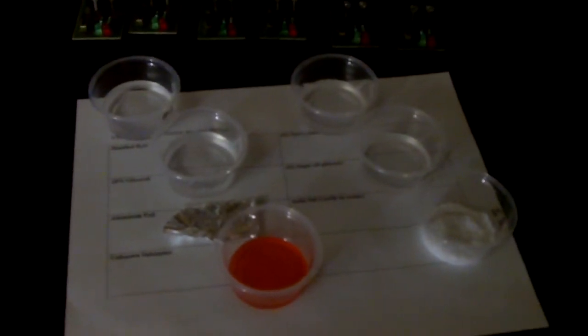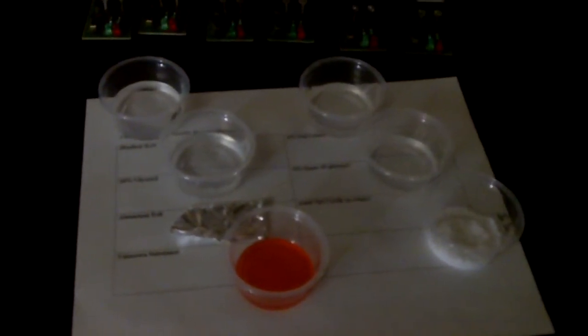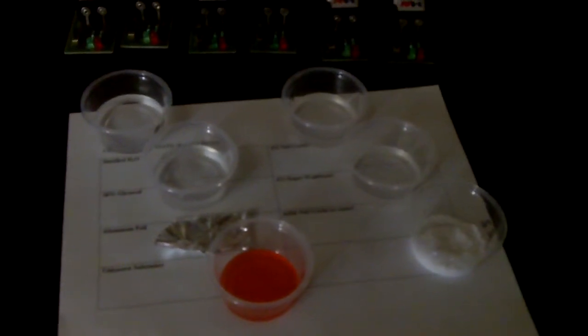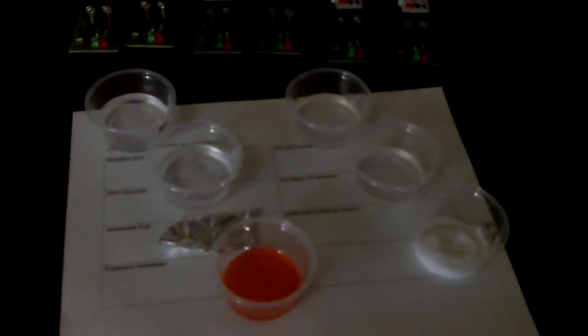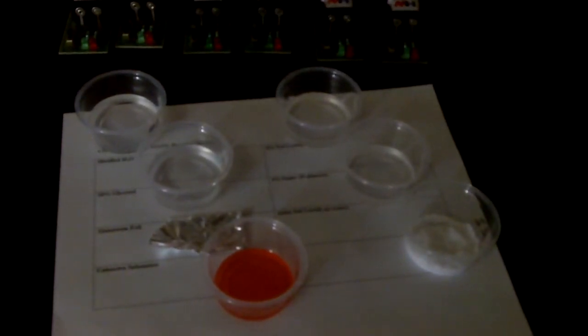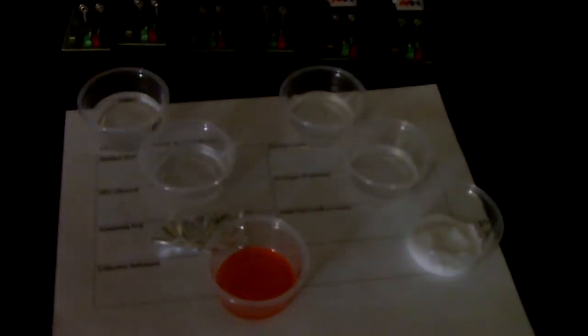Data. Use a small-scale lab approach. Add only 3 drops and no more of each solution in the space on the cover sheet. Touch the conductivity meter leads on opposite sides of the drop. Assign conductivity to categories: none, weak, strong. Note, clean the meter leads between measurements. Also, take care not to touch the conductivity leads together. A little bit of an edit to that.